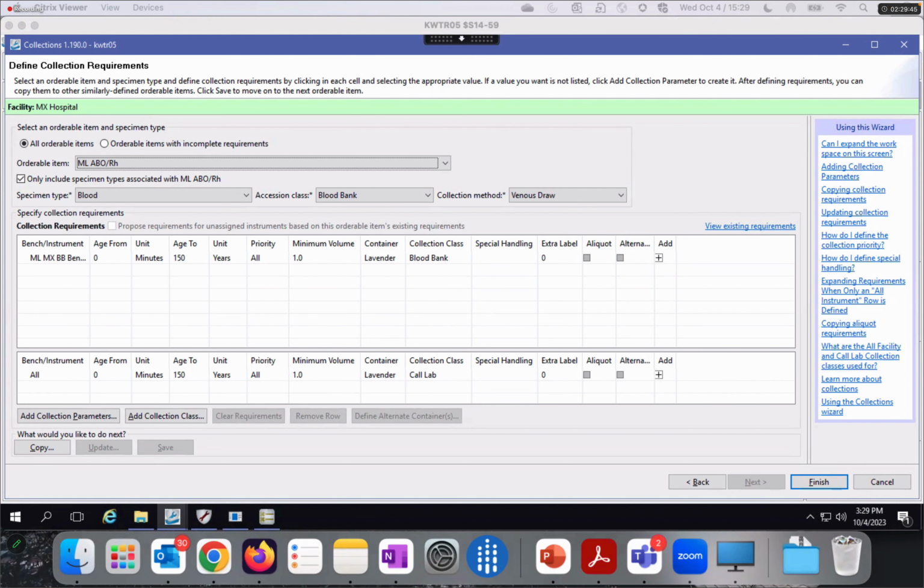But the accession number would remain the same. Yeah, it's not going to grandfather into the build that already has been, to orders that have already been placed. Correct. Yeah. So that's why I said I'm not going to go back and re-add the orders because it's not really necessary for what we're doing, because we're trying to keep this relatively simple.